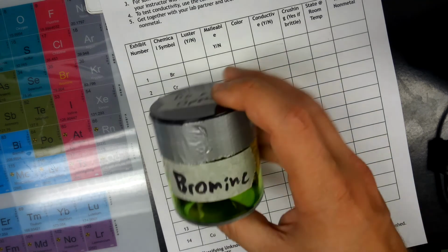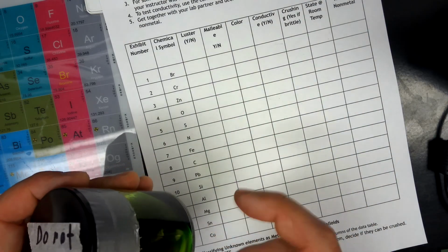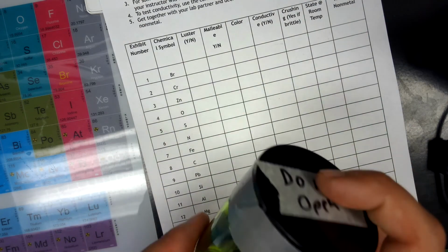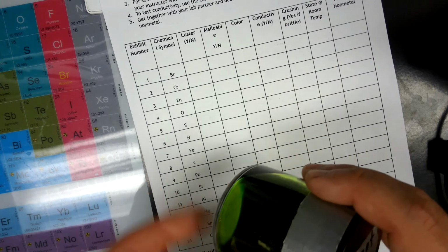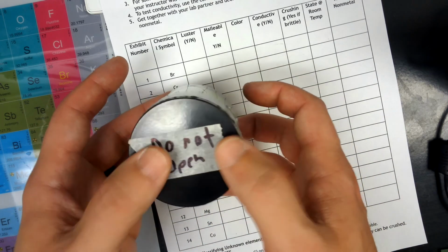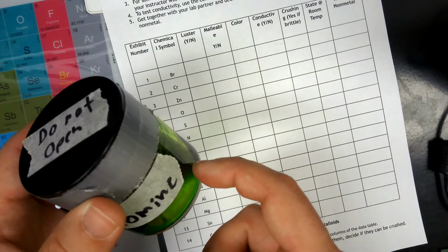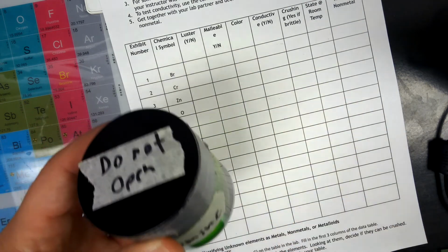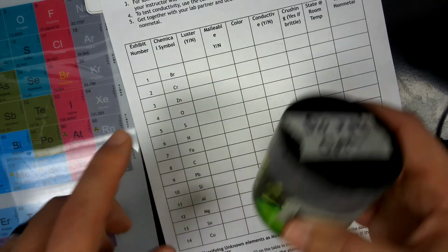So first off, I got bromine. Bromine's one of our only liquids at room temperature, so that's why it's kind of cool. Depending on its concentration and impurities, it can be a couple different colors, but this one is green. I do have this do not open on some of the different things if you were in class, either for ones that are dangerous, such as bromine, or ones that I know are not conductive and get a little bit messy. So let's go through this.